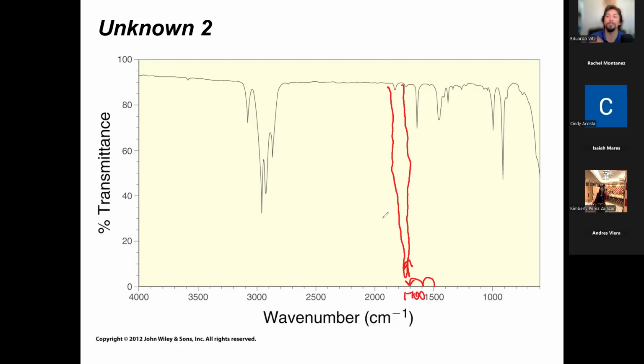So there's no carbonyl, there's no carboxylic acid, there's no amide, and so on, right? Do we see an OH over here, a kind of strong, kind of smooth OH in the region we expected? We don't see an OH either. We don't see an NH. Otherwise, it would look something like this, right? We don't see it either. So we're not seeing much of anything. So what do you think it is? What could it be? That also gives us information.